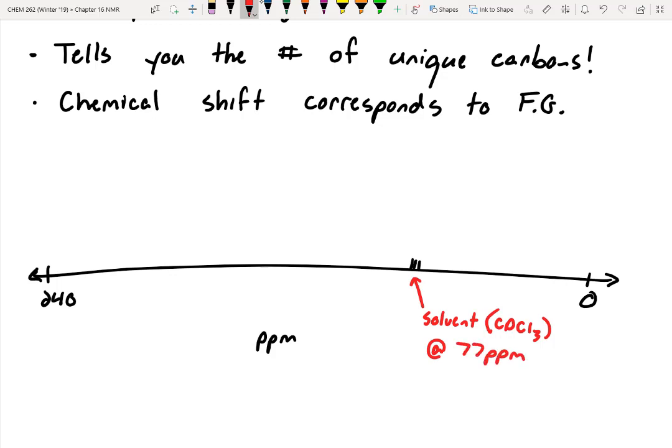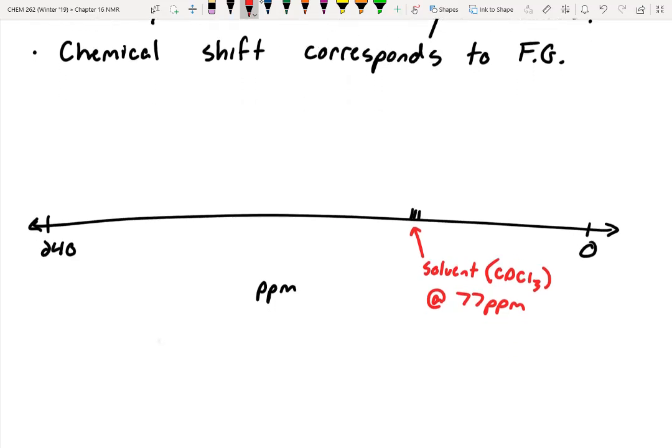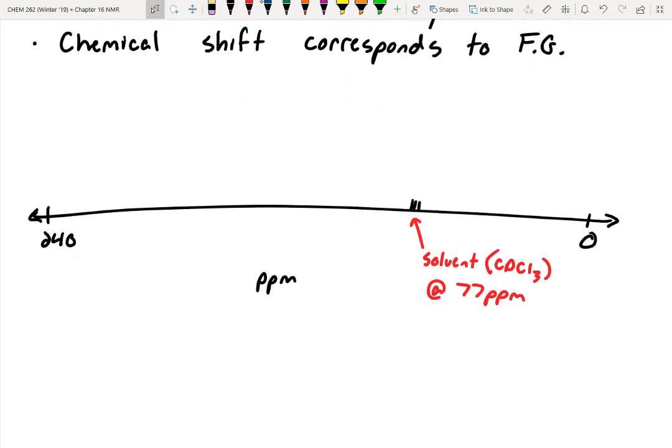In fact, we use this solvent peak as an internal standard, so we tell the NMR that peak should be at 77, and shift things around so that it fits right. So if you do see those 3 peaks, they don't belong to your molecule, it's just the NMR solvent. The unfortunate thing with carbon NMR is we can't really avoid having C-13 in our chloroform. We can't isotopically get rid of it. So you're always going to see that solvent signal.